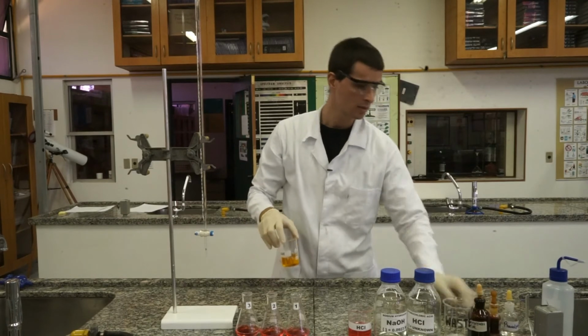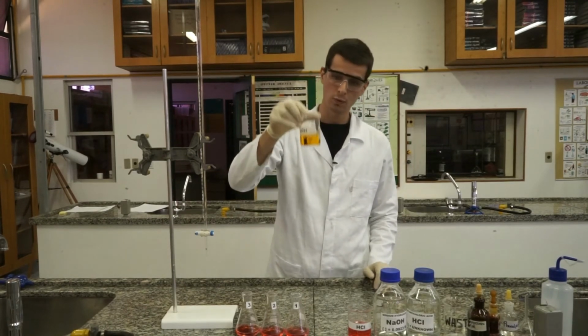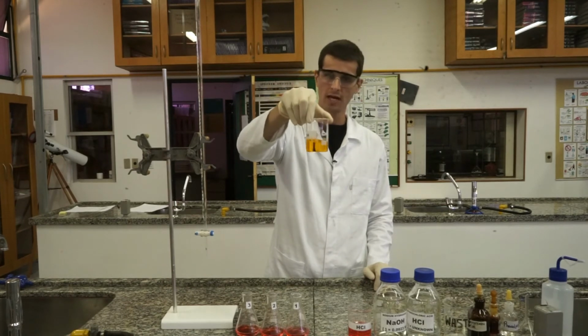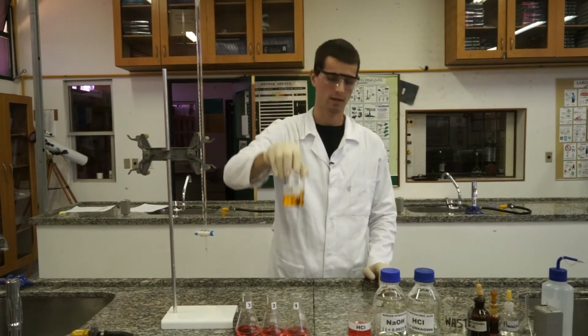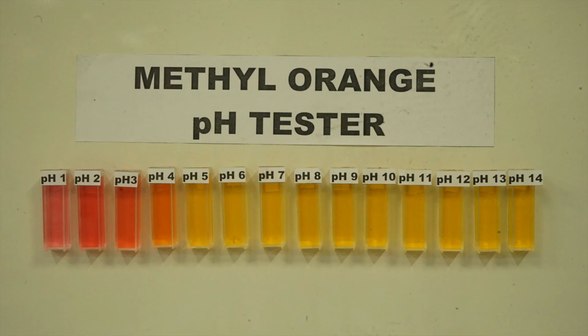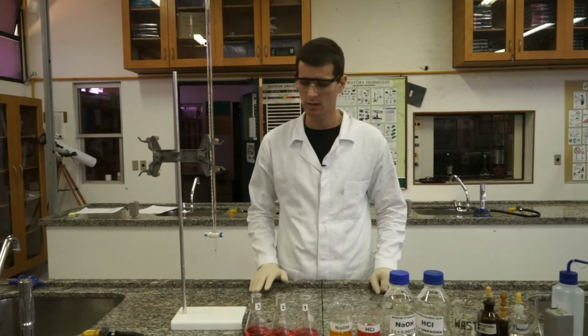Our goal is to reach this yellow color. This yellow color will indicate that we have reached the end point, the equivalence point. So now let's start the titration.